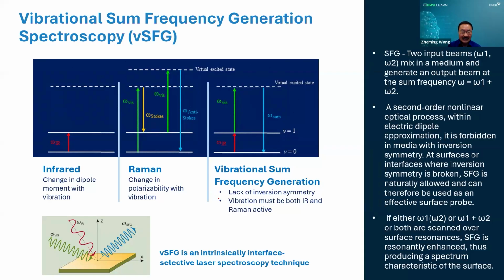And shortly after that, in 1962, by that time, there had already been a report that if you operate a ruby laser at room temperature and at liquid nitrogen temperature, the laser emission wavelengths actually differ by 10 angstroms. So from that, the same research group operated one laser at room temperature, another at liquid nitrogen temperature.